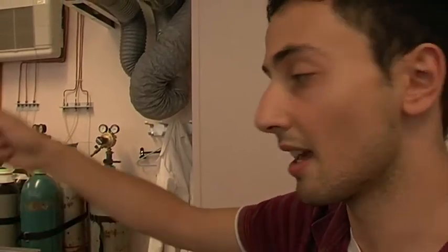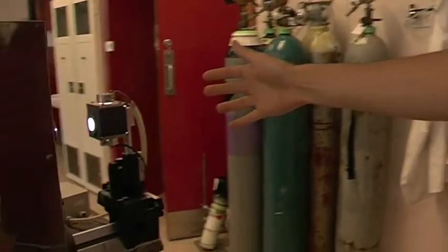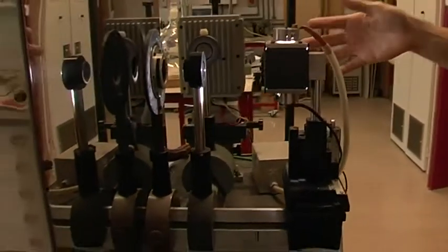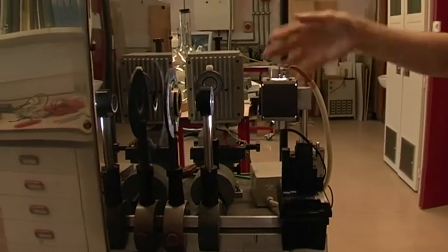We monitor the temporal behaviour of this species using UV absorption spectroscopy. This is our UV lamp — it's a xenon lamp.